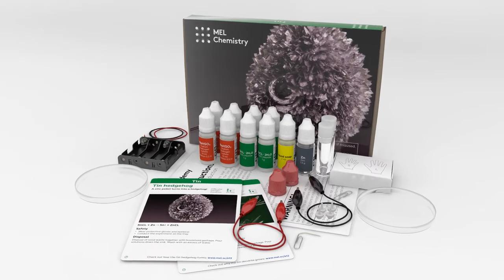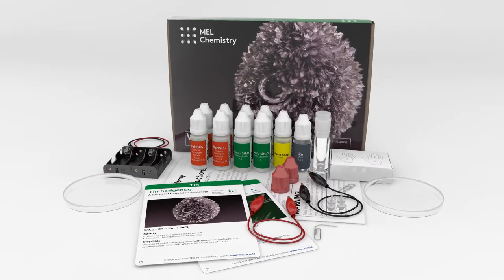Welcome to the wonderful world of chemistry. Today, with the help of the Tin Set by Mel Chemistry, we will grow a Tin Dendrite.